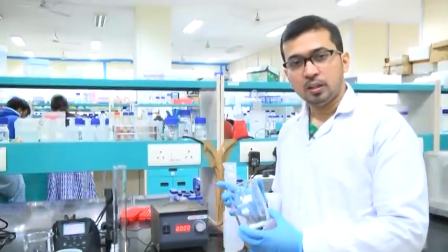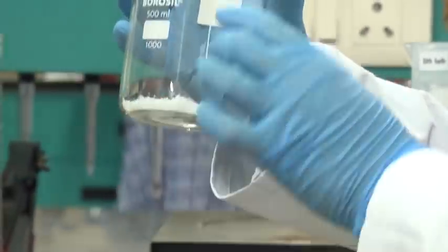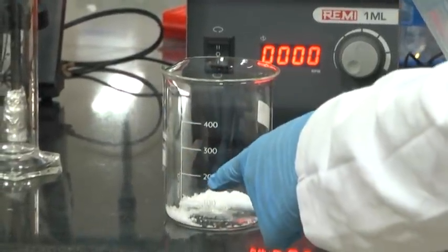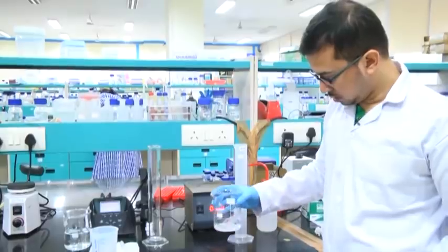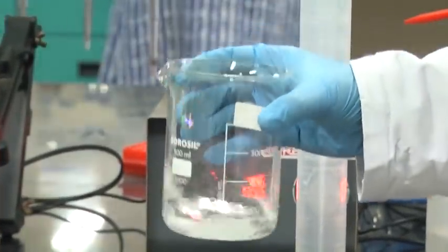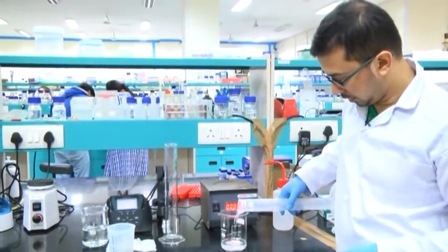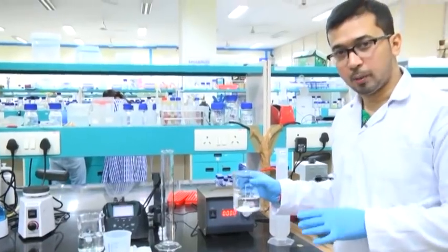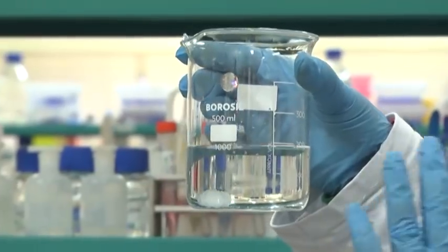Now we will dissolve the second one — sodium phosphate dibasic. Here we have taken the crystalline sodium phosphate dibasic. I will be adding around 200 ml of double distilled water. I will initially stir it gently; however, the solid components remain undissolved. So we will take it in the magnetic stirrer for dissolving.